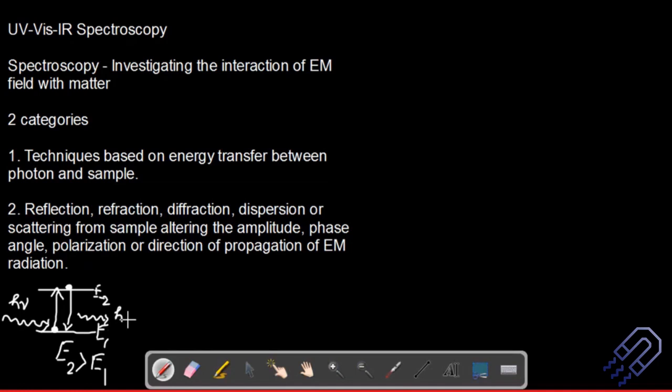And if we can analyze this radiation compared to this radiation, we can find out a lot of information, like how much time it is taking to come out. Is it giving out any kind of visible light? That means luminescence property. We can say it's a luminescent material. If not, it is not a luminescent material, and so on. These will depend on the energy gap. So these interactions will give us more information about the internal property of the material.